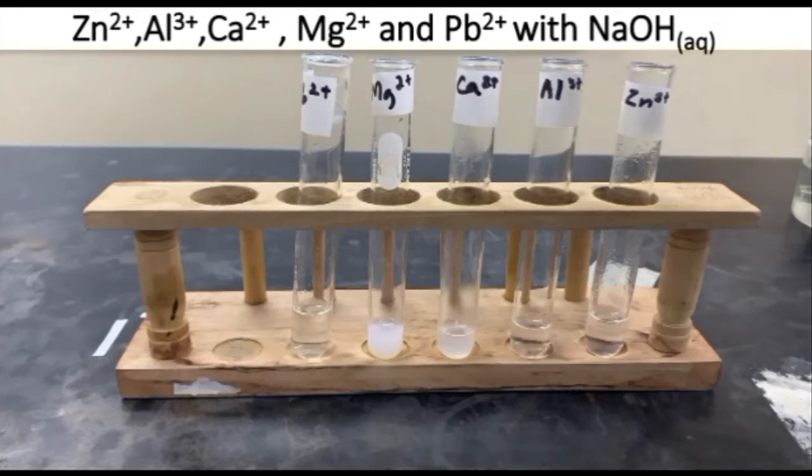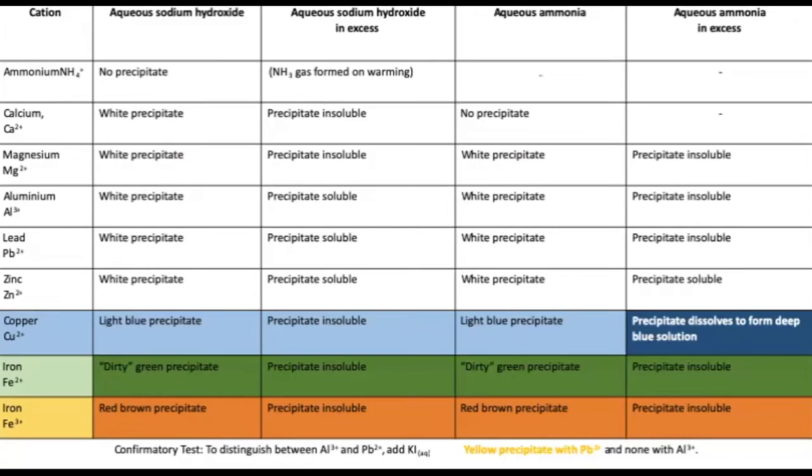So we'll now have to narrow down between magnesium and calcium, since both gave a white precipitate which did not dissolve in excess sodium hydroxide just now. In order to tell which ion is present, whether it's calcium or magnesium 2+ ions, we would have to subject it to a further test. In this case, we'd get a fresh sample of each solution, and we would add to them a small amount of aqueous ammonia and then until in excess. And that is how we would distinguish between our calcium ions and our magnesium ions.